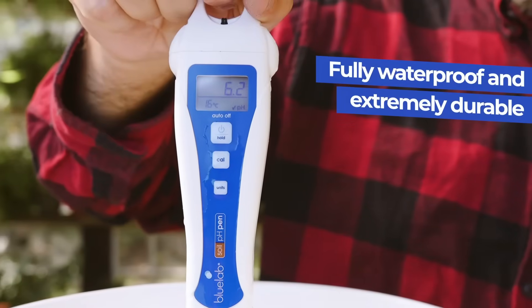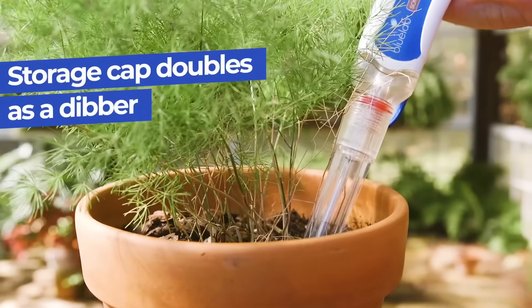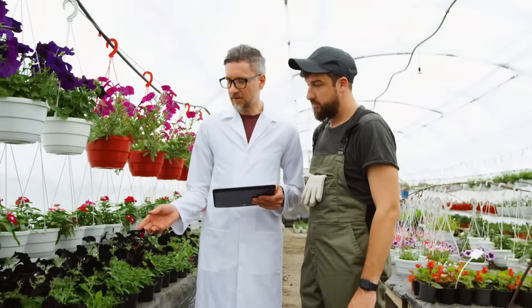This fully waterproof pen is extremely durable and designed for growers. It comes with a storage cap that doubles as a dibber to aid in soil measurements.